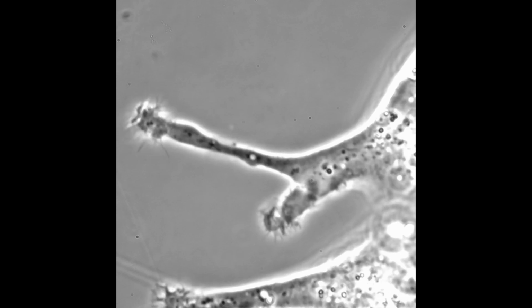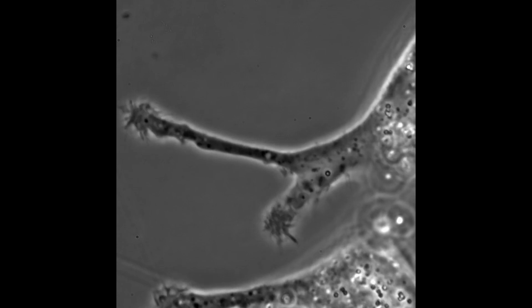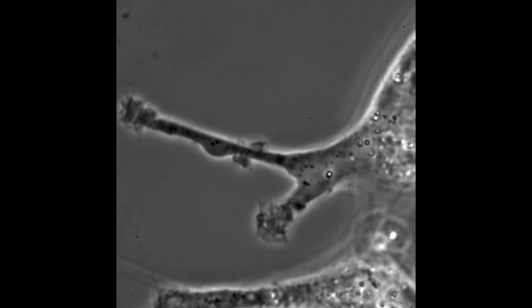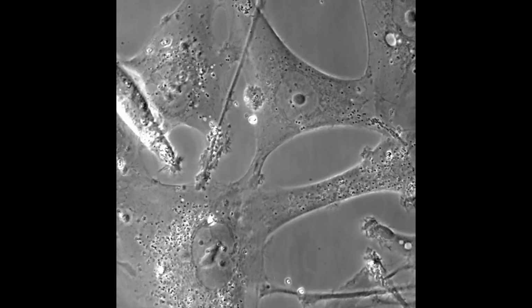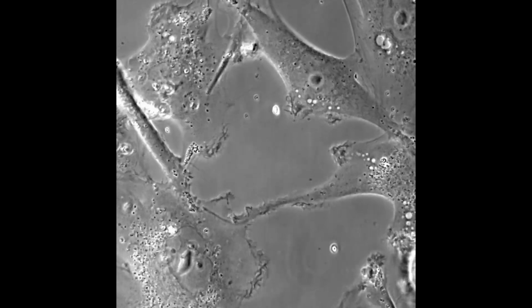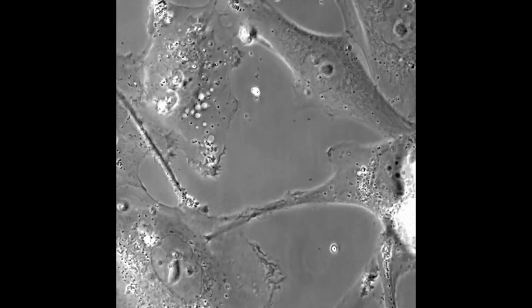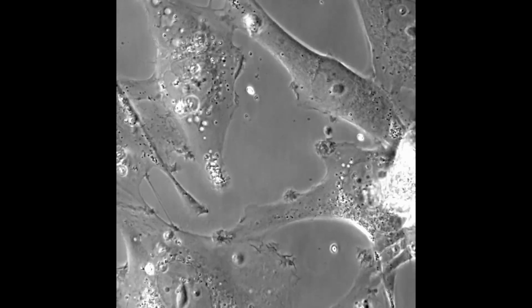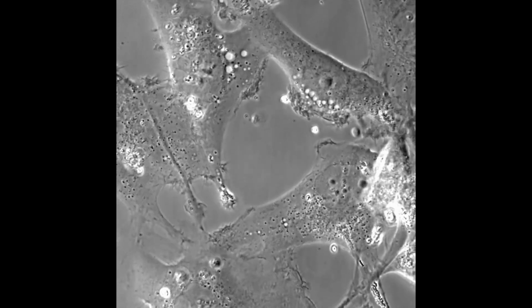If you look closely, you can see areas where new vesicles are forming. The cell membrane actively captures molecules from its surroundings, such as amino acids and sugars, and packages them into vesicles. These bubbles then carry their precious cargo deeper into the cell. So the cells are in the nutrient medium. It's a liquid I prepared for them, adding various nutrients, amino acids, and so on. They are surrounded by that, and they take up all these nutrients from the surrounding environment, forming these vesicles, as you can see.